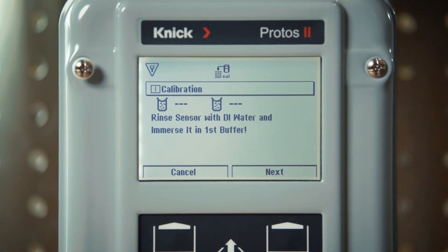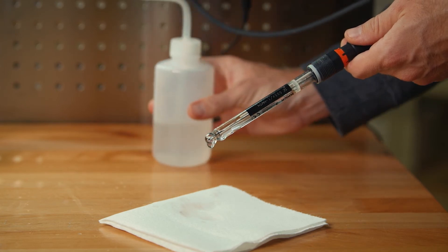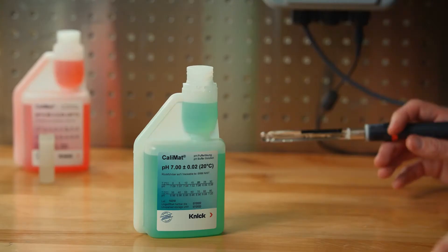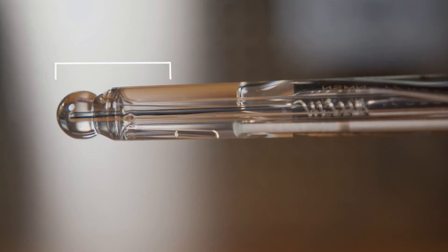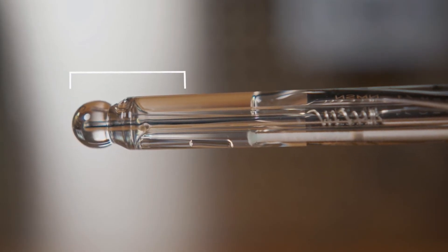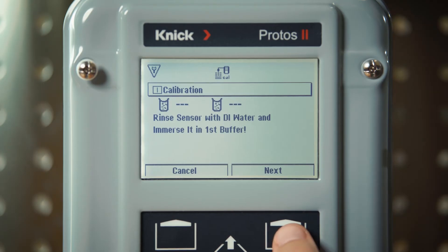Here, we are prompted to rinse the sensor with DI water and immerse it in the first buffer solution. We will do so and place the sensor into the buffer 7. Please ensure that the entire pH measuring bulb along with the sensor's junction are immersed in the buffer. Stir lightly and then press the next button.